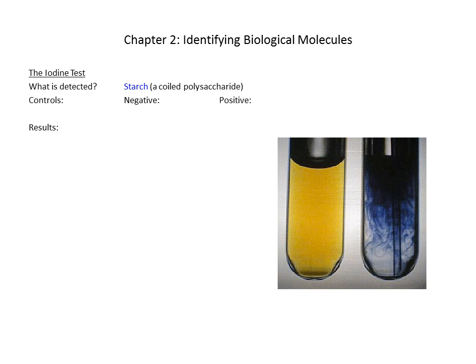So when you have a positive result, it looks like this blue stuff here on the right. Going in, your solution should be whatever your sample is, plus this little bit of a brown color from the actual detection reagent.